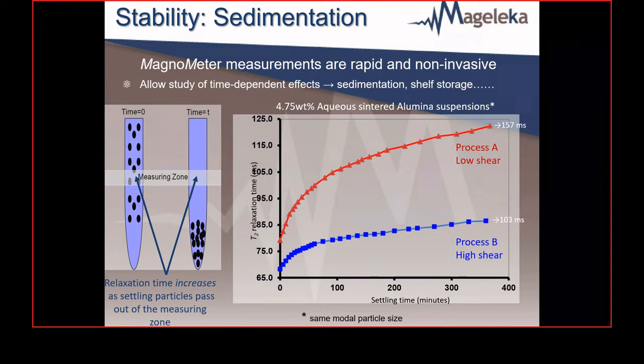Now, there are various techniques available to study sedimentation, such as analytical centrifugation. However, AC is based on the application of Stokes' law, and it's critically influenced by the hydrodynamics of particle settling and the details of sample prep. AC performs best for spherical particles under laminar flow conditions, which means dilute suspensions of spherical particles with reasonably narrow particle size distributions.